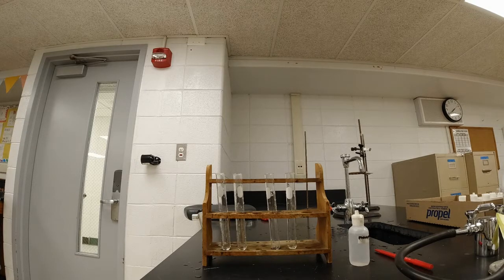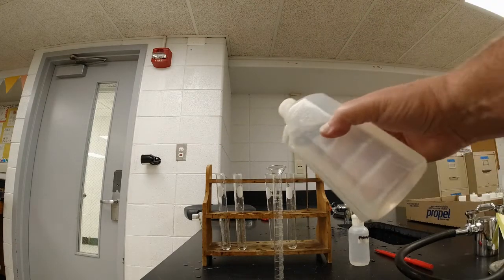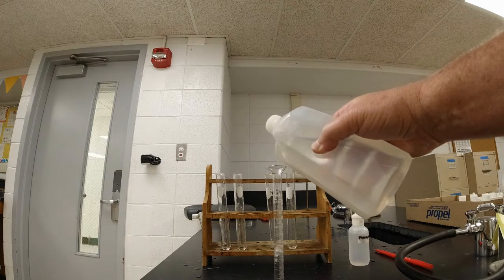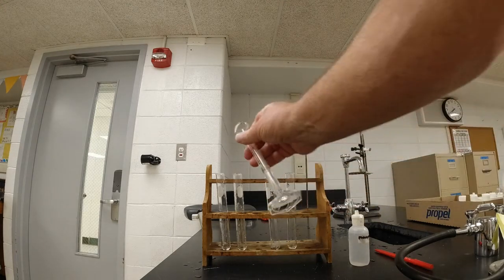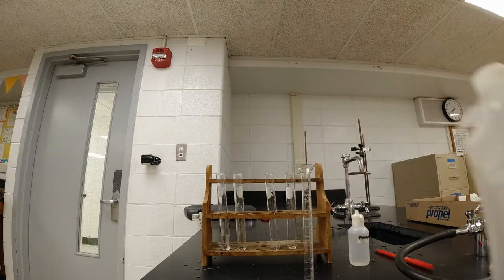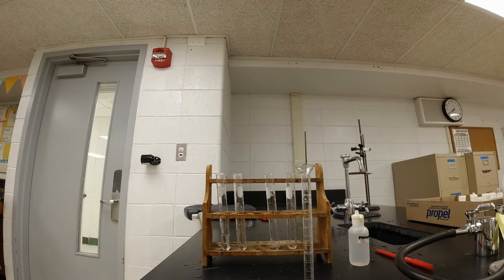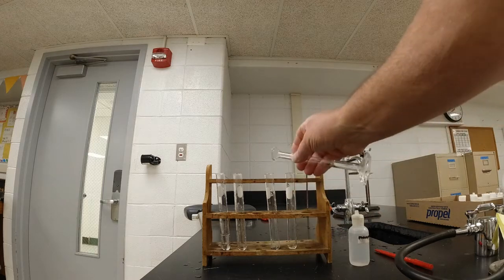First part, we're going to compare magnesium and calcium. I'm going to put 5 milliliters of water. I'm going to get a graduated cylinder here. I'm going to put 5 milliliters of water in the first test tube. And I'm going to put 5 milliliters of water in the second test tube to test the magnesium, so I'm doing everything the same between the two. I'm going to pour that in there.